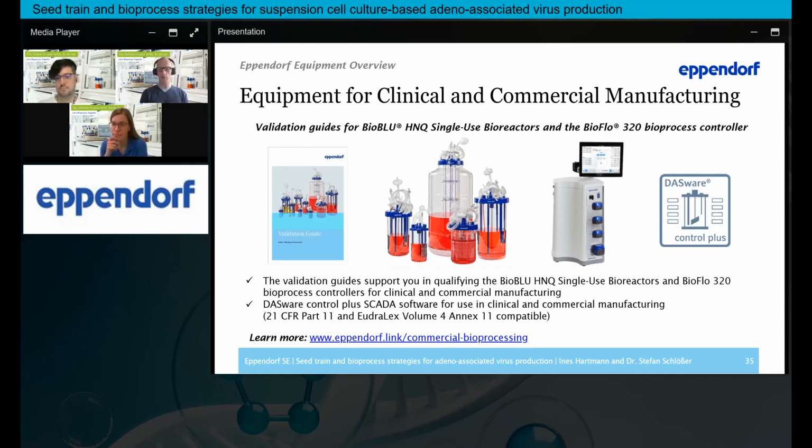The question is, would you recommend using baffled or unbaffled shake flasks in general? So you already touched on this topic a little bit, but apparently there are some more detailed questions on this. Ines. Yeah, in general, when it's about comparing cultures, the non-baffled is more promoted, I would say, from literature and so on, because the baffles, if they are in the bottom, create, of course, more turbulence in the shake flask.